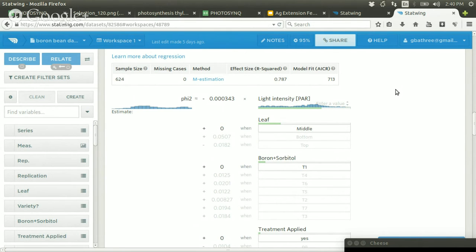Can you tell somebody what to do directly based on the data, right? So they go out and take a measurement and it says, hey, there's too little water, or there's too much fertilizer, there's too little of this. And the answer is, right now, no, but that's something that we are working on.